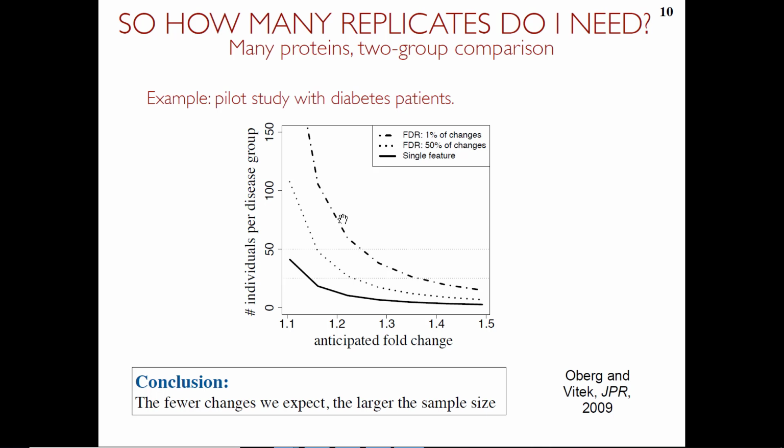So to me, this is something which is really underappreciated because there's really this gold rush for longer protein lists. But what I'm finding, just from the literature and also from working with collaborators, is that people don't have enough appreciation that if you want longer protein lists, the sample size actually has to follow. You will not get the same result with the same sample size and a longer protein list. So in fact, I'm personally a big advocate for not trying to increase the protein list at all costs, but rather focus on what is of interest to you in your experiment and filter things out.